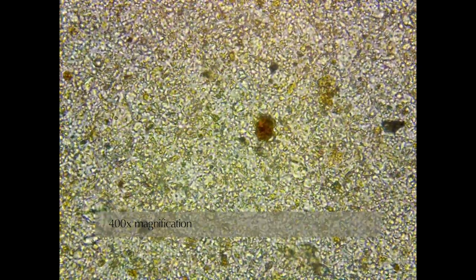Sometimes, especially when the soil is very fine, already saturated, or not given enough time to settle before pulling a water droplet for the slide, the first images are too overloaded to see specific organisms or fungi. As demonstrated here, even increasing the power of magnification doesn't always help.